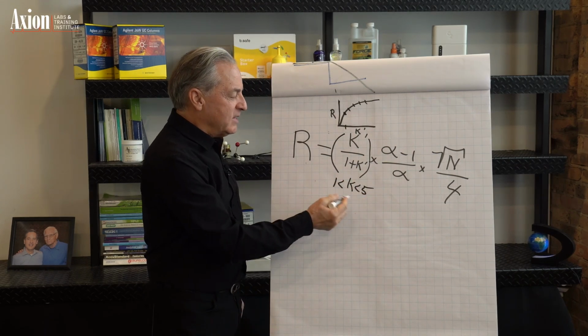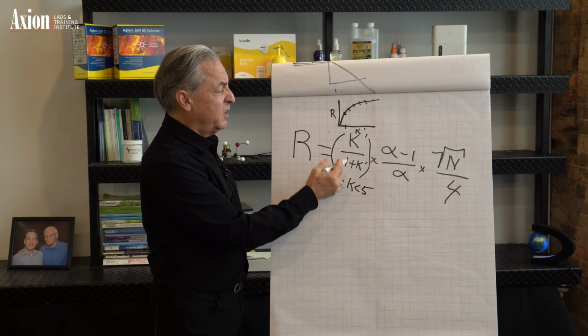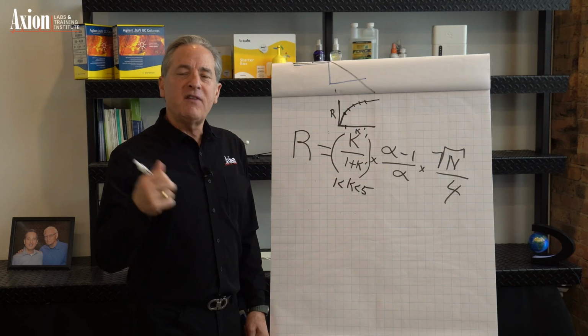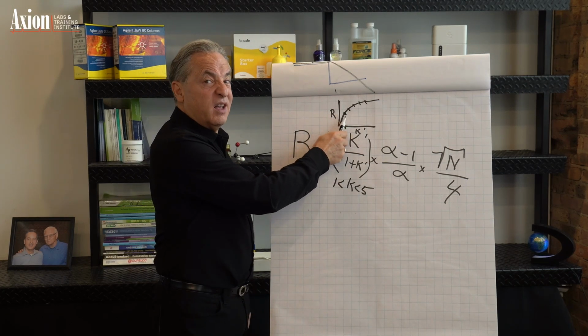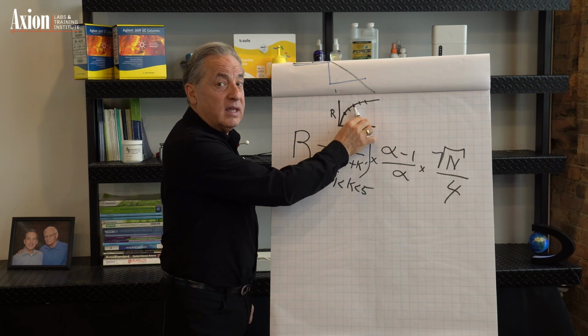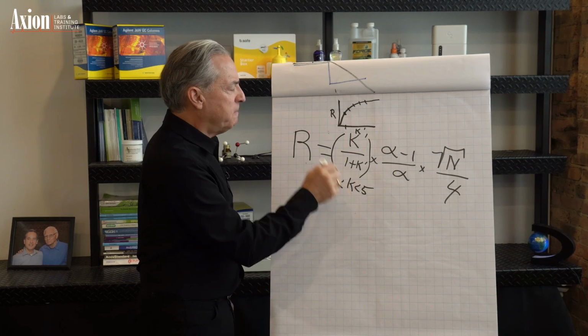And you understand this is not an exact number where you're going to fall off a cliff, but what it tells you is if you're less than 1, you're sacrificing a lot of resolution. You spent $75,000 to buy that LC, and you're throwing 90% of it away because you're impatient. So this says, hey, just back that off a little bit, get a good capacity factor, get a good resolution. So that's where that number comes from.